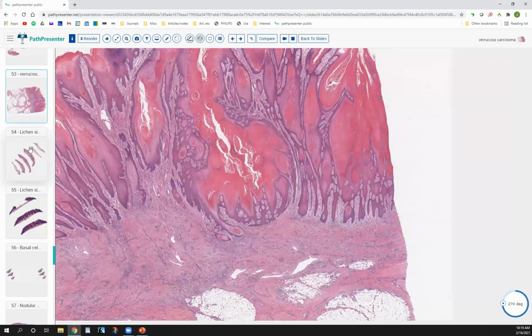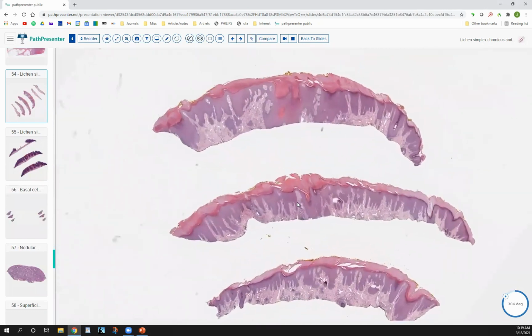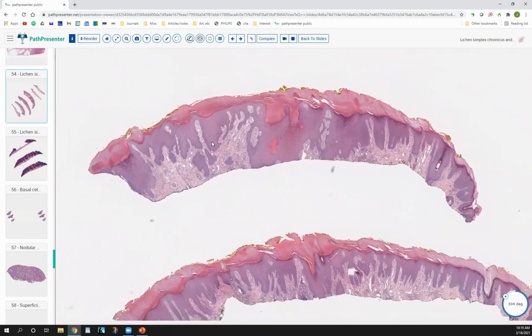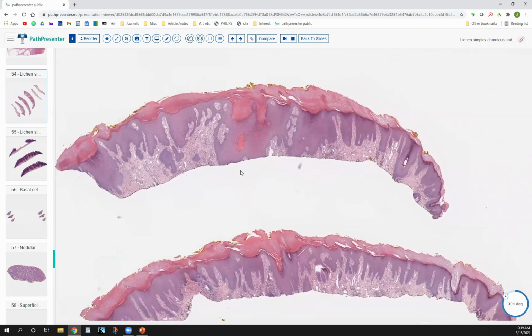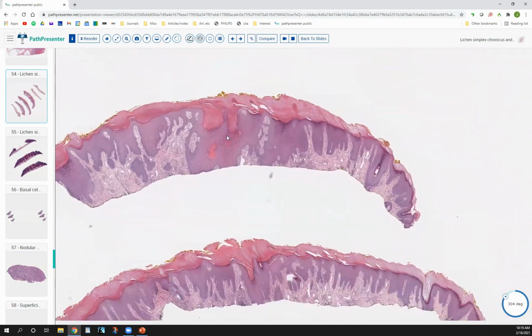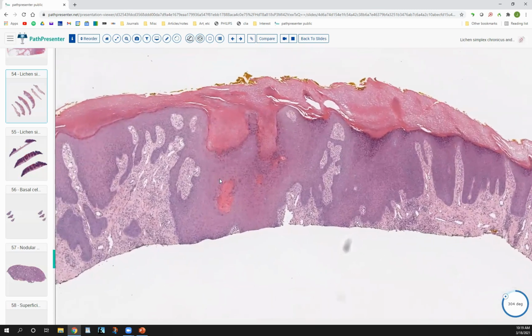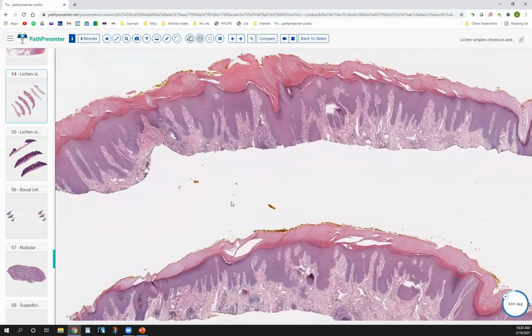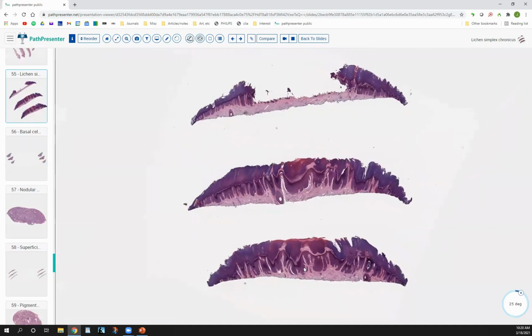Okay. So we'll move on to something that can mimic verrucous carcinoma, but is actually much more common and has its own distinctive appearance. This is actually lichen simplex chronicus, but I thought it was a pretty good representation of pseudoepitheliomatous hyperplasia. You also get this sort of downward growth, but not nearly as extensive as the bulldozer effect of verrucous carcinoma. And the areas of proliferation are generally centered around follicles. So you can get a lot of hyperkeratosis, a lot of hypergranulosis, and similar to verrucous carcinoma, you don't have any atypia. So you really just want to look for that extensive, deeper process in verrucous carcinoma to differentiate the two. So anytime you have pseudoepitheliomatous hyperplasia, you'll know that you want to look for an underlying cause.